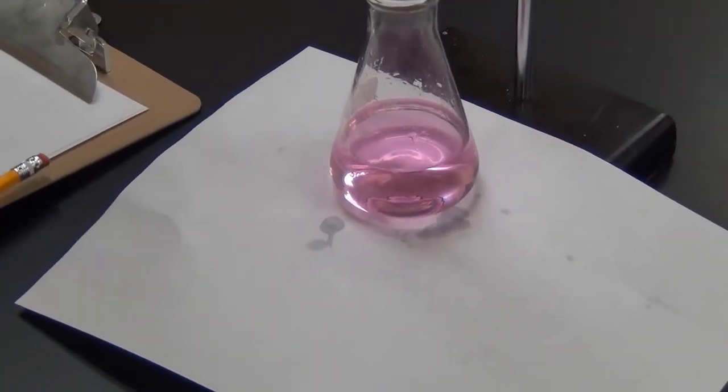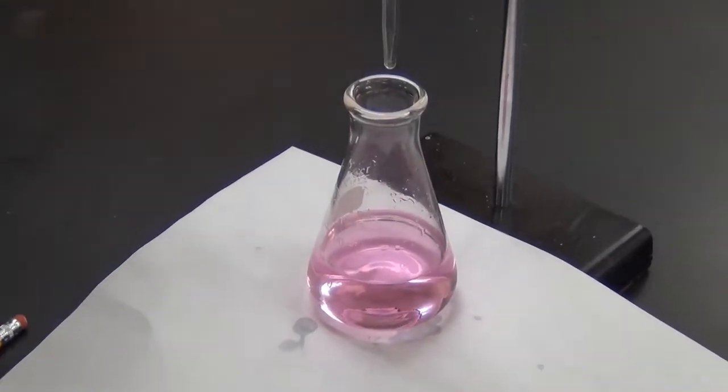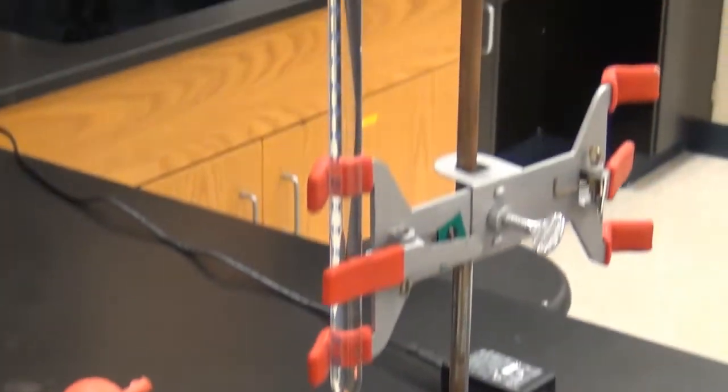Okay, so now we have a persistent pale pink color even with swirling, so we can get the final volume for our sodium hydroxide.